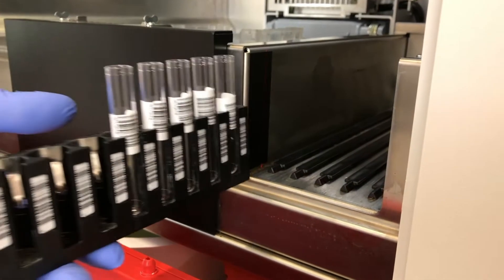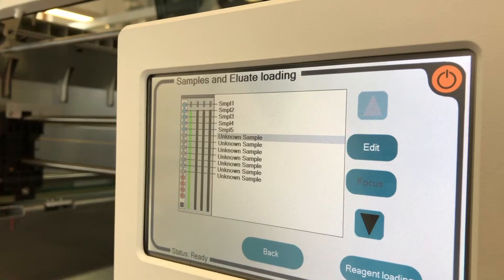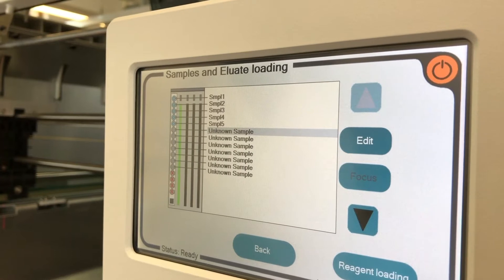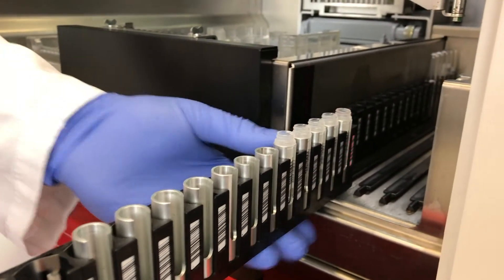Load samples to the loading bay equipped with a barcode scanner. Barcoded samples are detected and displayed. Load eluate tubes to the loading bay.